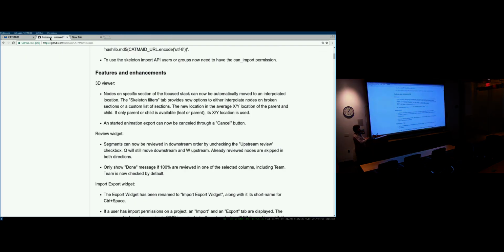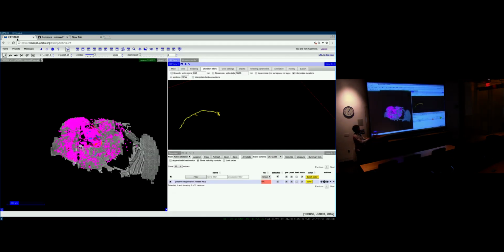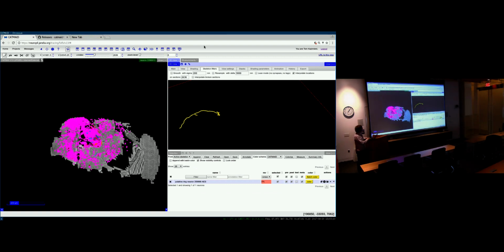Can you put multiple sections? Yeah, you can put a comma separated list in there. So at least it should. Let's try. If it explodes, then, oh, can you actually hear me? Yeah. OK, good. So let's see, 2640 maybe. Yeah, OK. I think it does it, but do you happen to know another section that's broken? But it should, anyhow. It should work.